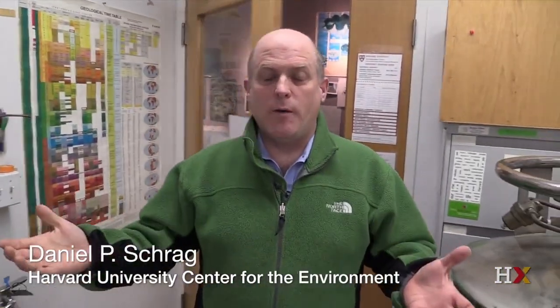This is the laboratory where we make the isotopic measurements to reconstruct ancient temperatures. So I'm going to show you the different mass spectrometers we use and how we can actually take calcium carbonate samples and end up measuring the composition of carbon-12, carbon-13, or oxygen-18 and oxygen-16.